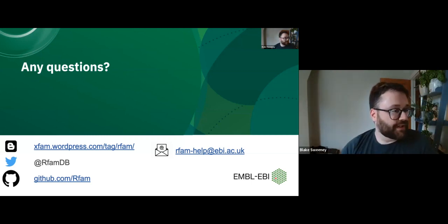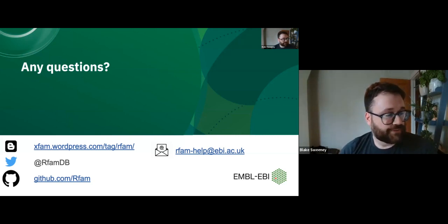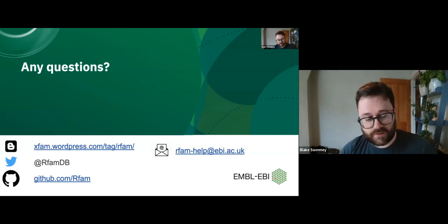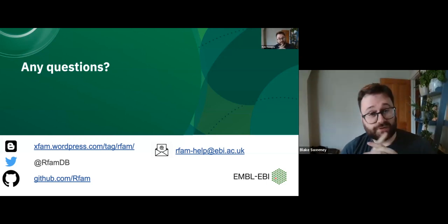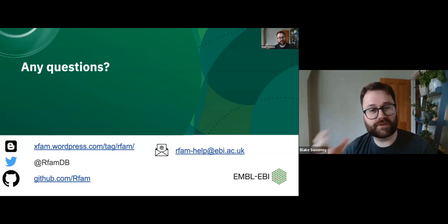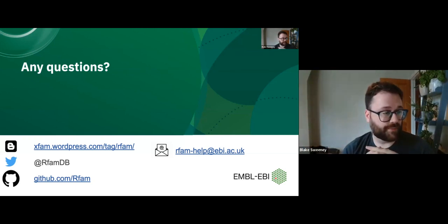So there's a question, is it easy to know which species are available? Do you mean which non-coding RNAs are in which species? We do have pages in Rfam for a particular genome, say the human genome, and it will provide you a link to go to all the hits that are in that particular human genome in Rfam. That is available on our site.